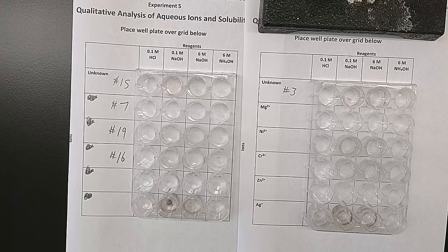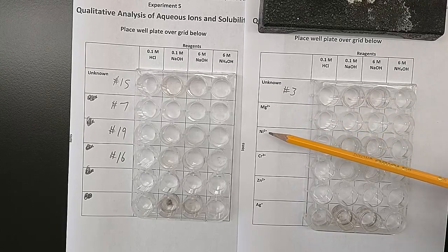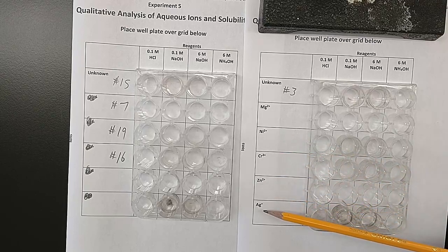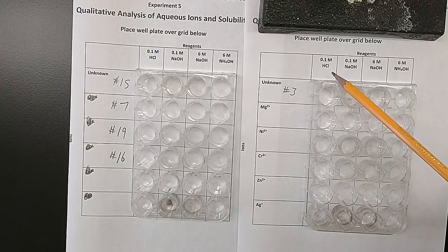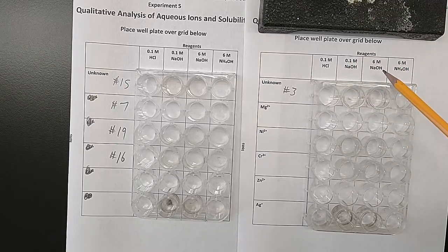So this week in our lab, we're going to take solutions of magnesium nitrate, nickel nitrate, chromium nitrate, zinc nitrate, and silver nitrate, and react them with solutions of hydrochloric acid, dilute sodium hydroxide, more concentrated sodium hydroxide, and that same concentration, 6 moles per liter of ammonium hydroxide.